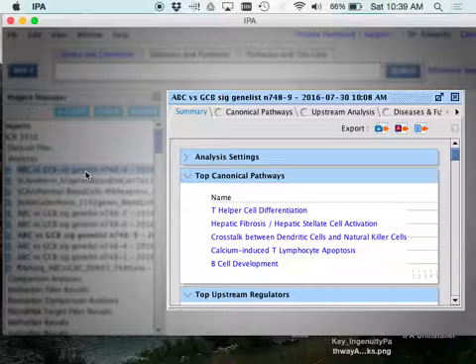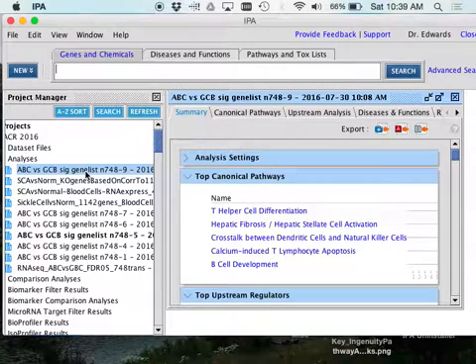So what this is doing is, bioinformatics at its heart is: what are the odds that I get something contained, this certain amount of genes that we have collected, that we know share something? What are the odds that I pull all of this stuff in, say, any gene list? The reason this works is I have limited things to choose from.